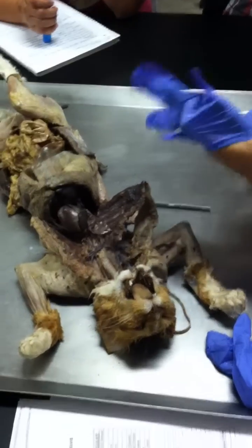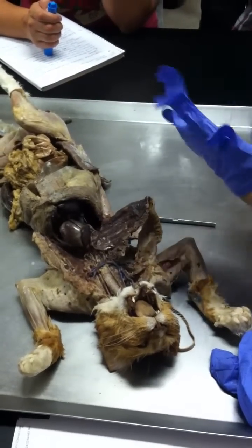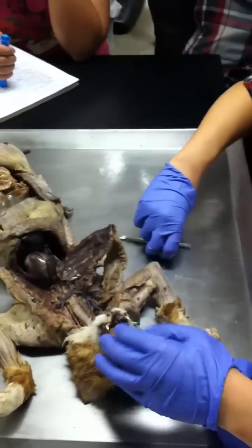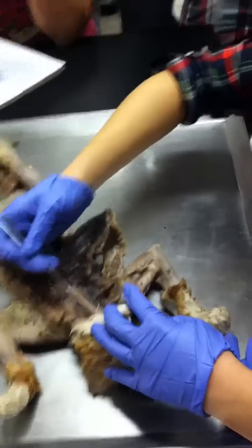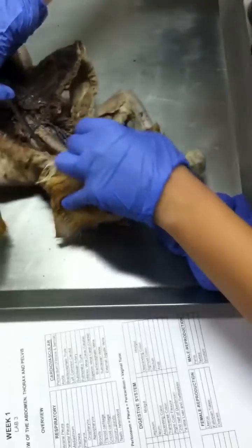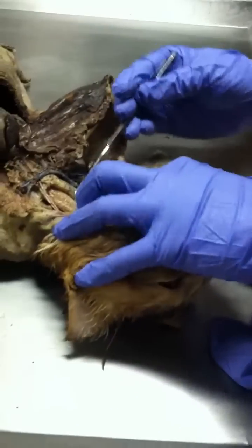Tube starting from the mouth, going all the way to the anus, right? Like there's a big tube called the alimentary canal, right? The alimentary canal starts with which tube? Esophagus. The esophagus, right? Food goes down the esophagus first, right? And see how that's this structure right here?